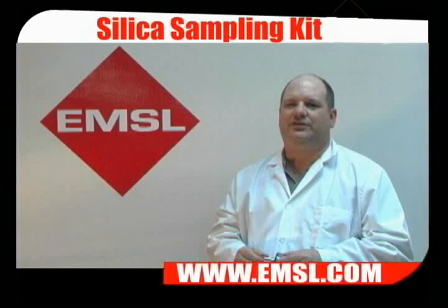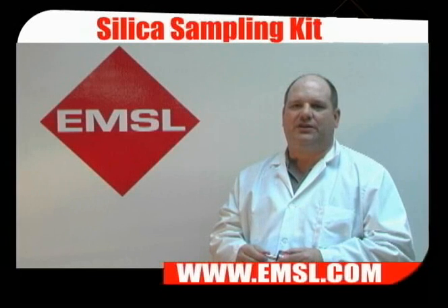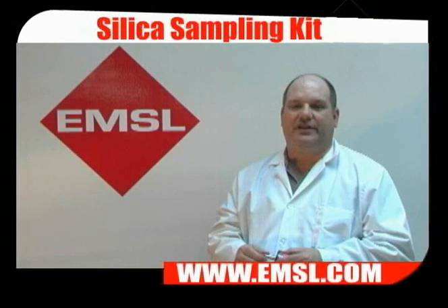When you're finished sampling, do a post calibration. Disassemble the sampling train, close up the cassette, and fill out your chain of custody.